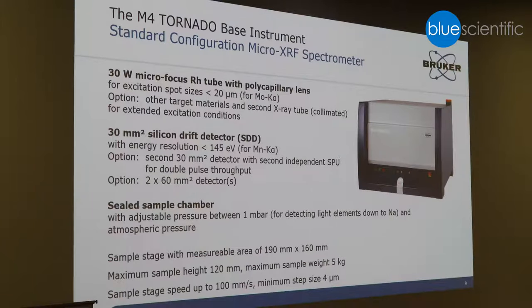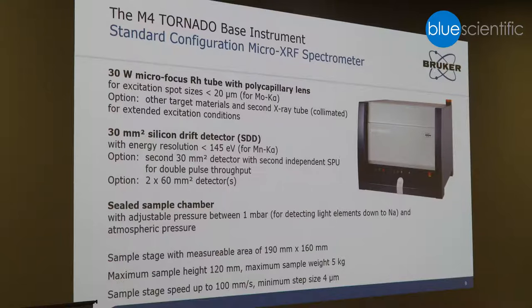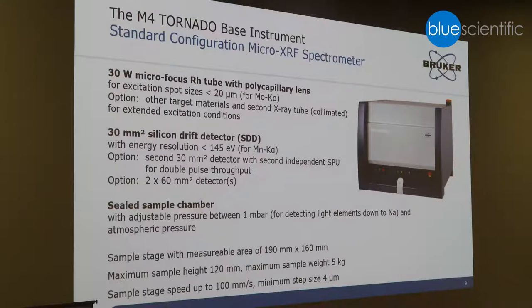The standard configuration of the system, which has been on the market now for eight years, is the M4 Tornado. It's equipped with a microfocus tube of 30 Watt, a solid-state silicon drift detector, and also the option to use two detectors, which has the advantage that you can collect and process more counts. It's a closed chamber, so you can evacuate between one millibar and atmosphere.